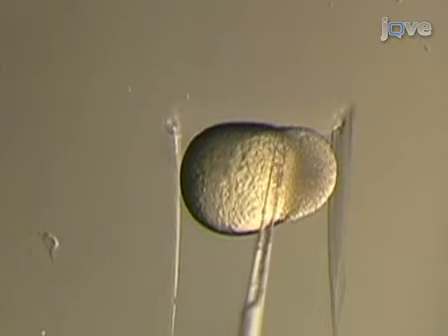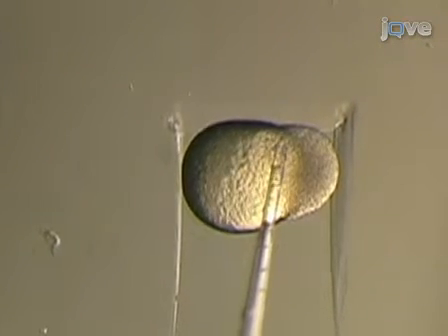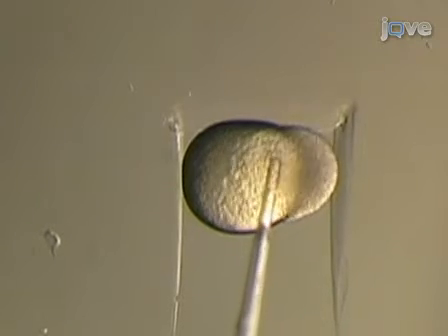After the cell transfers have been completed, transfer the donor-host pairs to the agar-coated wells of a 24-well plate to continue developing.